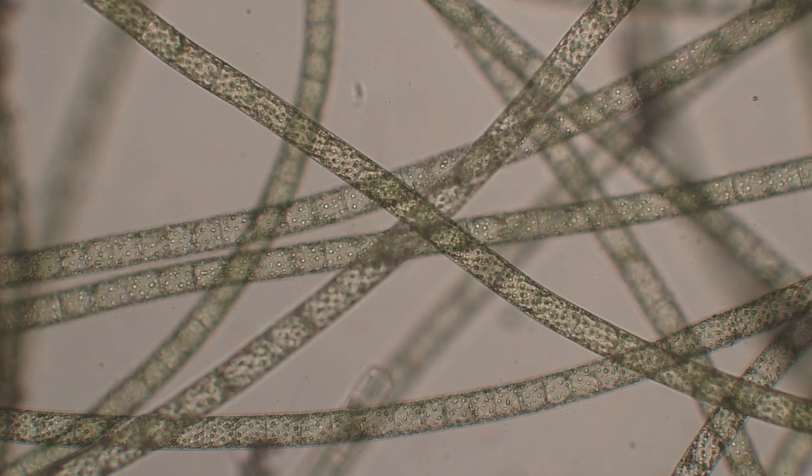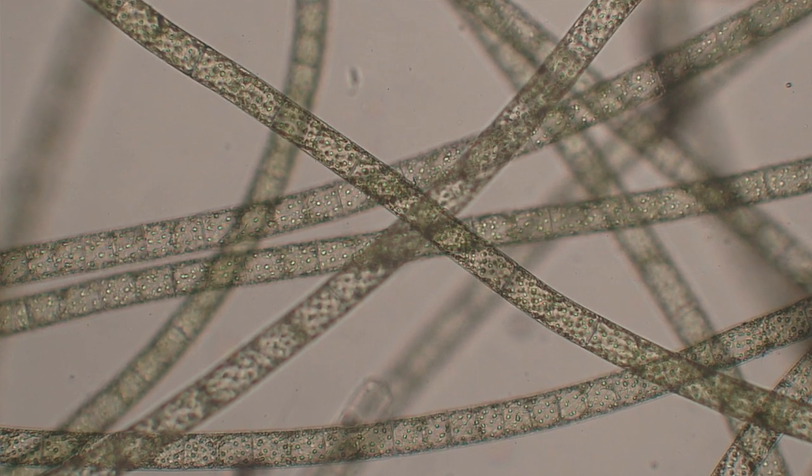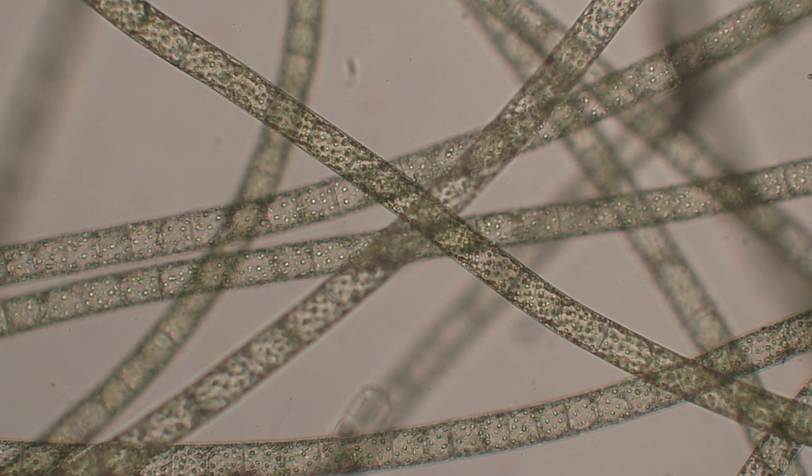This is definitely an alga — it's blanket weed. Sometimes in ponds you get these horrible mats of green filamentous algae that form slimy clumps. People who have ponds often battle against it and spend a lot of money trying to get rid of it. But if we look at it under a microscope, we can see something really rather beautiful — each of these filaments is made up of individual cells stuck together end to end to make a long strand.